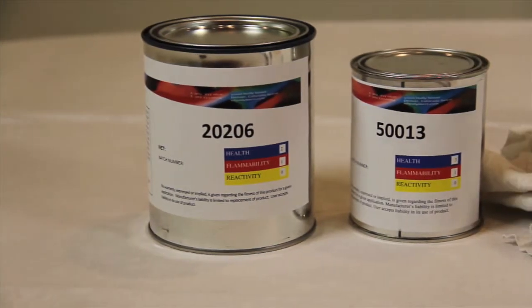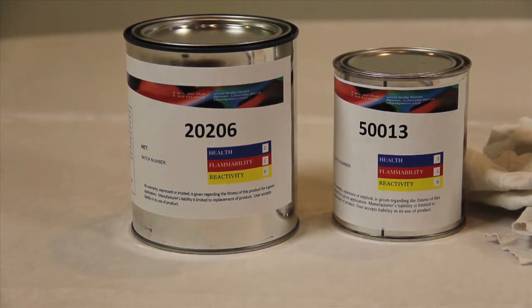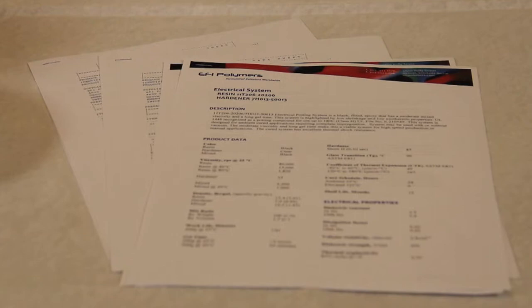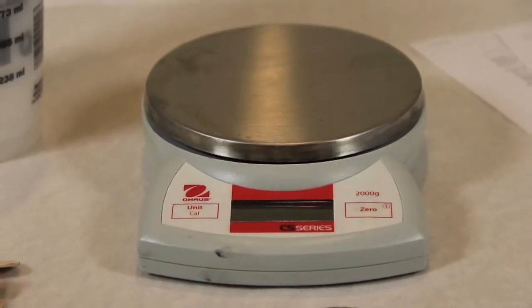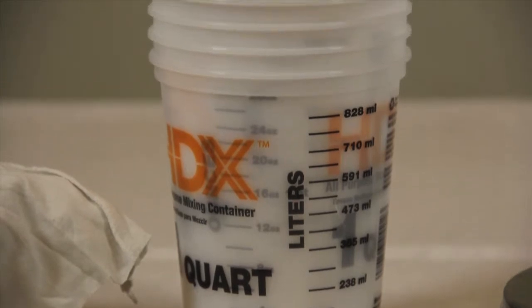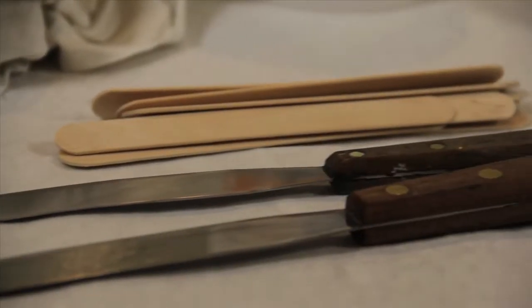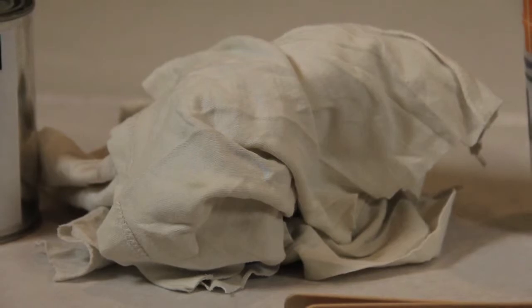The two-part epoxy or urethane system that you will be mixing, the technical data sheet and MSDS, a scale that measures in grams or ounces, at least two mixing or measuring cups, mixing sticks or spatula, and rags or paper towels for cleanup.